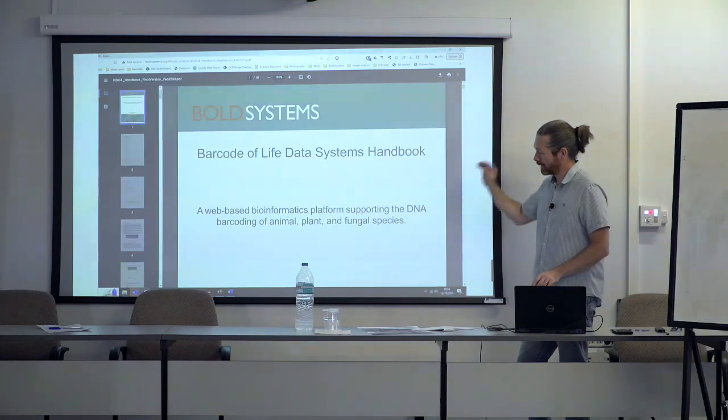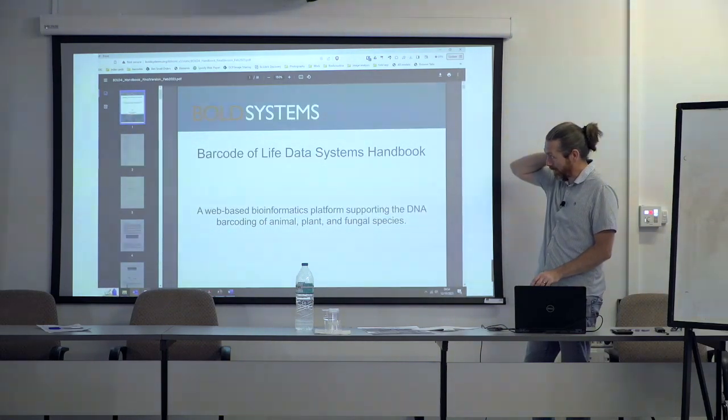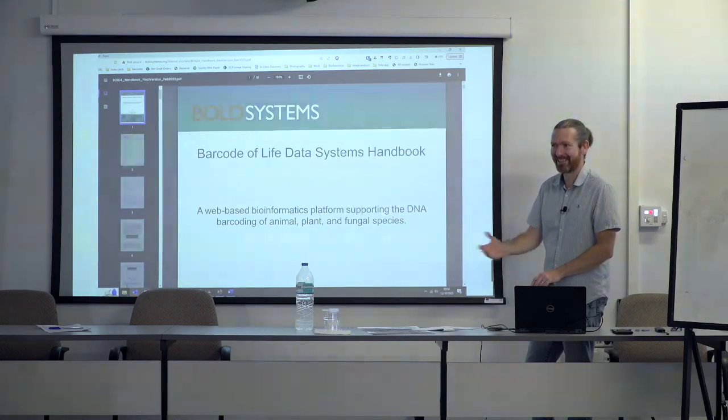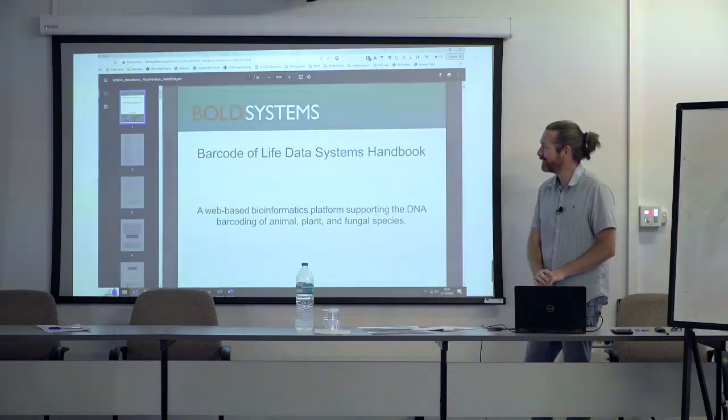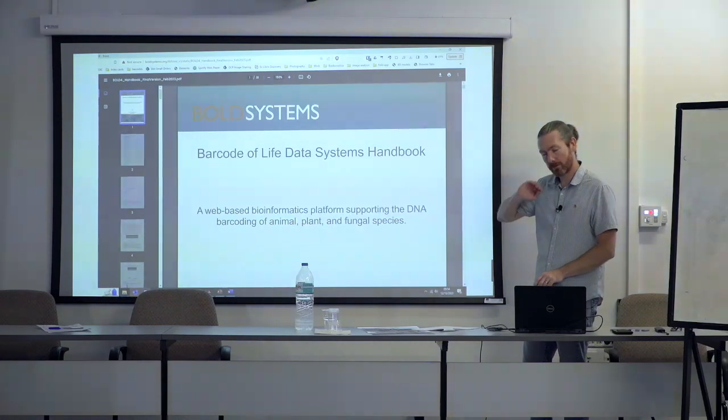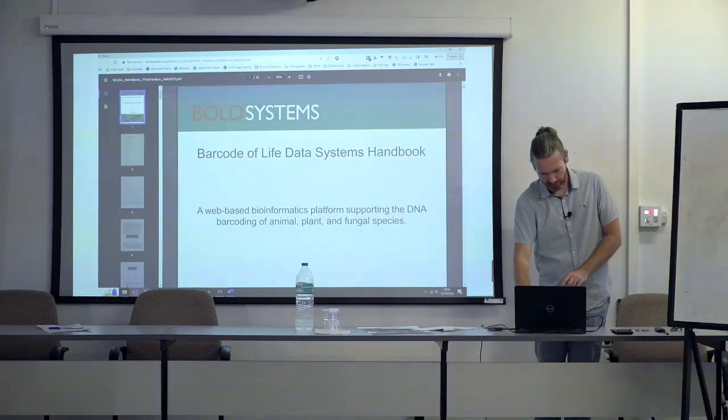It's really good. Whenever I speak to someone at BOLD and go, yeah, I really wish you guys did this, they're like, have you looked at the handbook? Did we do that? I'm like, I just don't read. So go there and get the handbook, and it walks you through every step of the way, which is great.